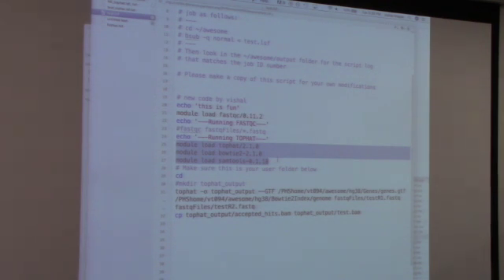Okay, Vishal. It's on there, but it's copying. You have to specify the end, otherwise it will look for TMP. You have to specify the end, space, just like that.